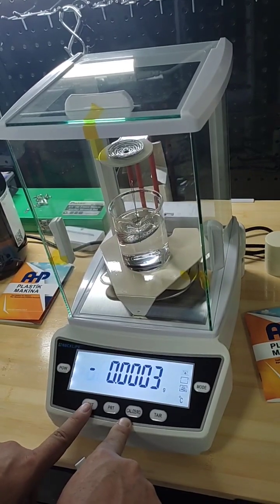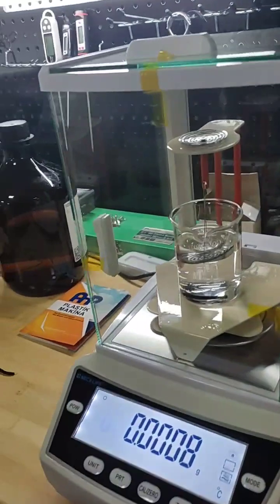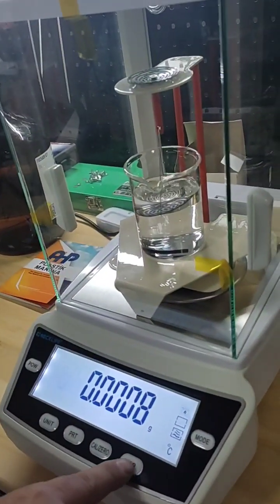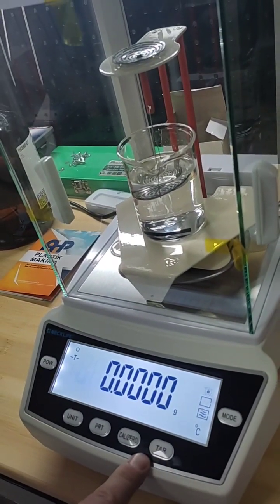Click on unit. And now the precise balance is set for density measurement using immersion method. Here the air is blinking. Click on tar.